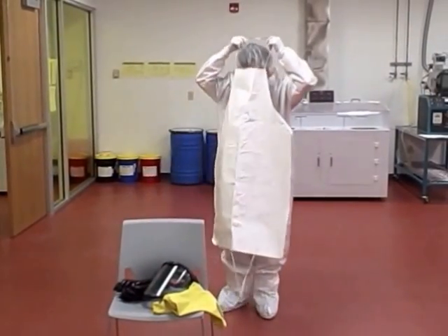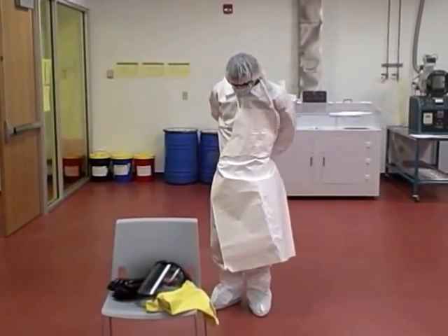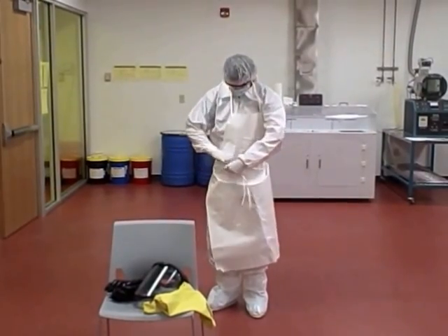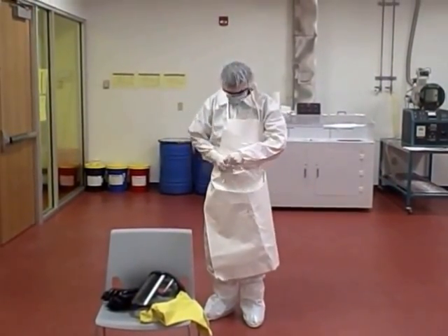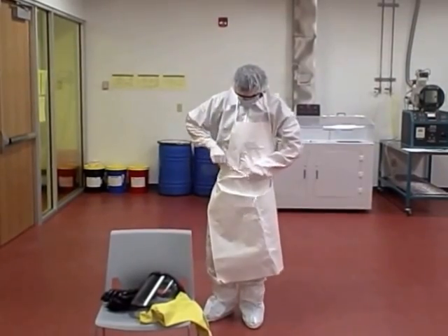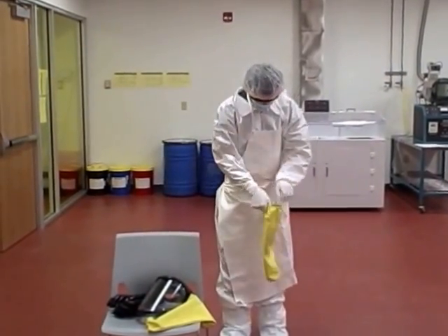Before entering the chemical room, put on an apron and tie the straps. Put on the yellow sleeves to protect from any chemical spills.